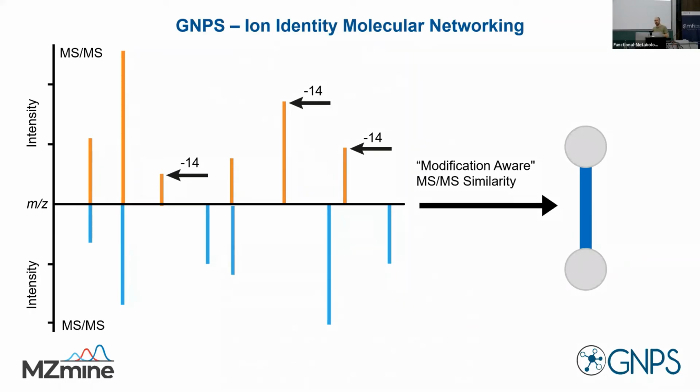That is to avoid a hairball effect. If you do not have filtering there and have a very low threshold, then simply everything will match somehow to everything, and you will just get one hairball of a network that is hard to make sense out of. So there are these values, but that depends on your data set and what you actually want to use. I would suggest starting with the default values. That's why we did this, and normally we get relatively good results with it, but you might want to look at this later on.